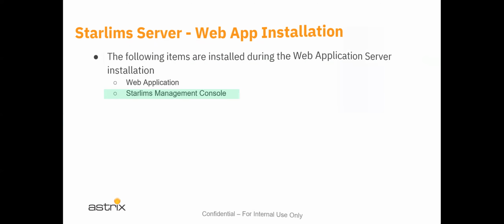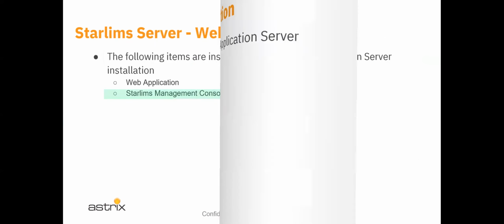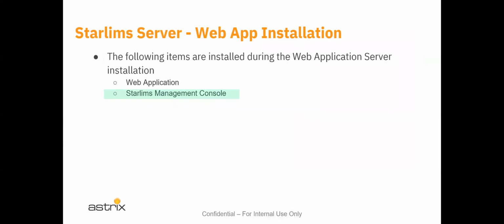And what that thing does is it allows STARLIMS to be configured and manipulated in terms of server cache, in terms of connection strings to the database. It's an end user tool that allows that type of manipulation to occur. You don't have to go into the weeds and into folders and edit text files that the application uses.